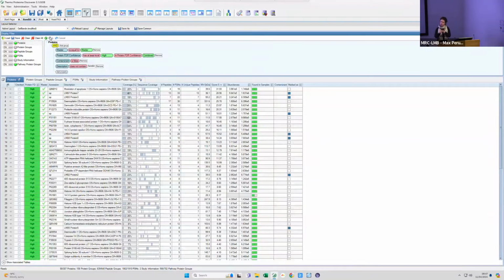But if you want a little bit more information about the quantification of specific proteins, you might want to go back to us and say, do you mind running it in PD? Because I do need to see what the most abundant proteins are. I usually recommend that we do this in PD instead of Scaffold, and that's just because of the different way that Scaffold looks at the data to establish a quantification value.